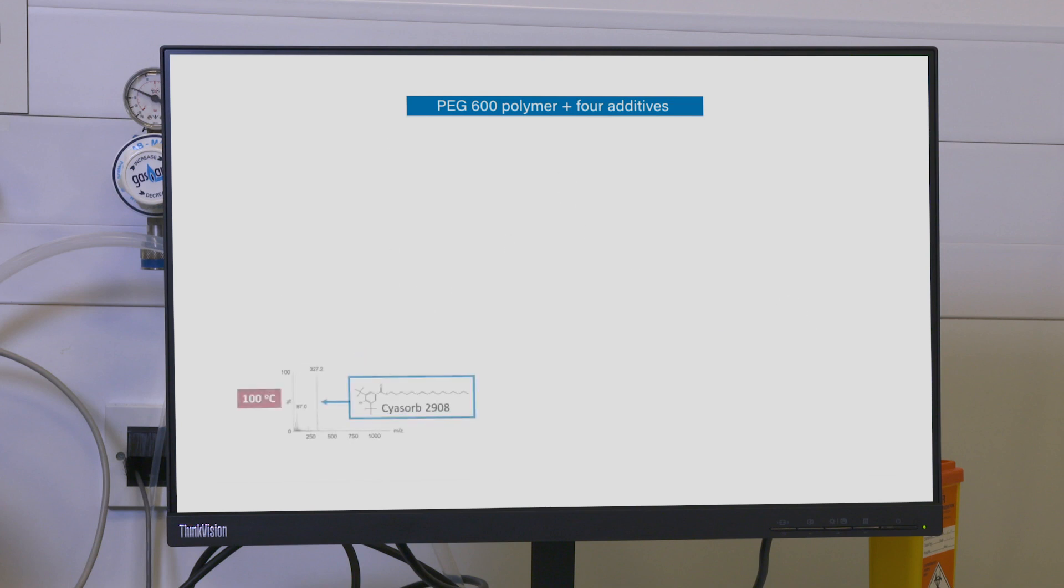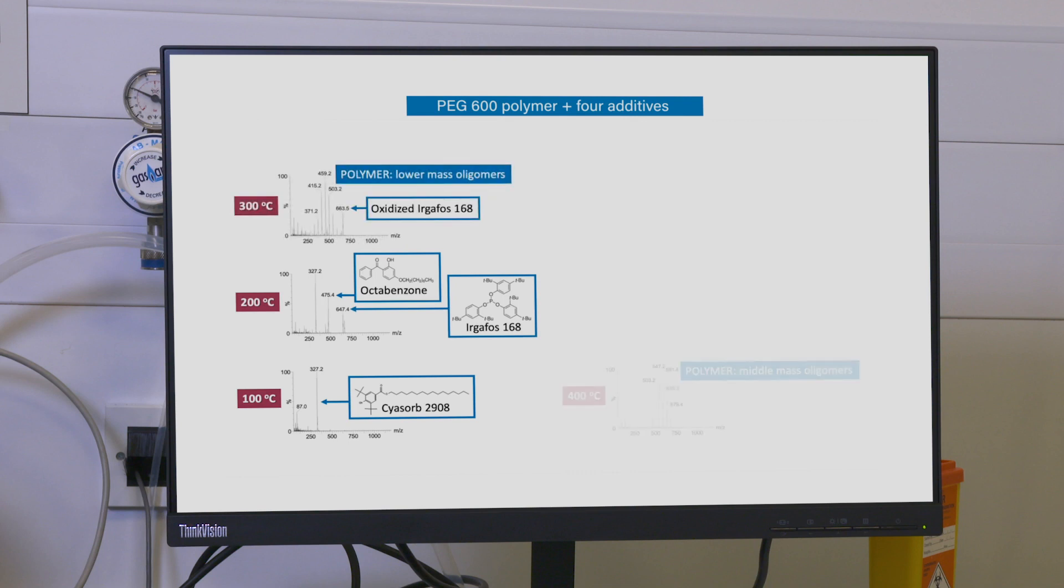In this example, the important polymer additives are detected at lower temperatures, and the polymer itself appears at higher temperatures.